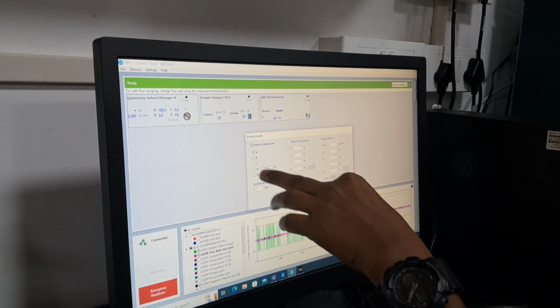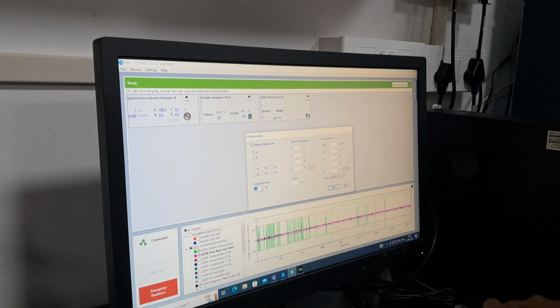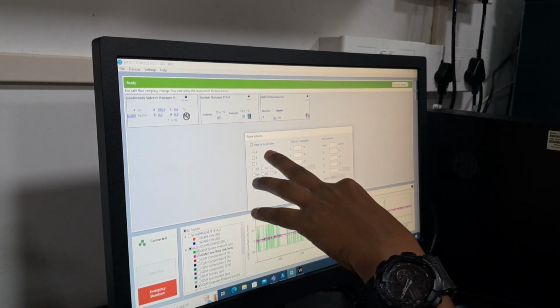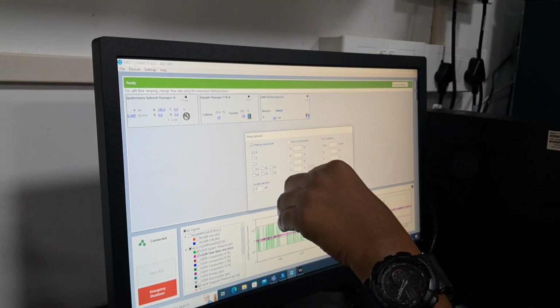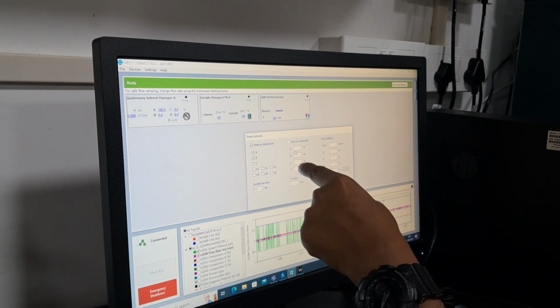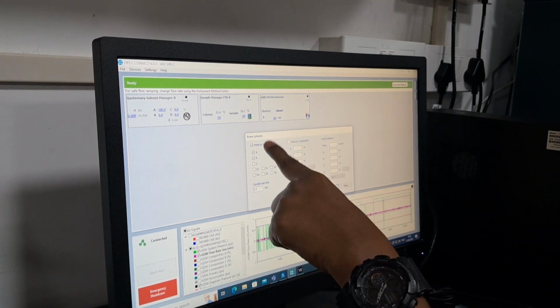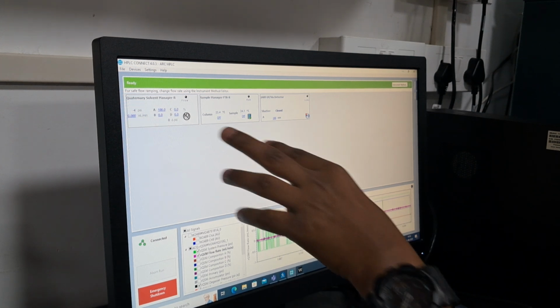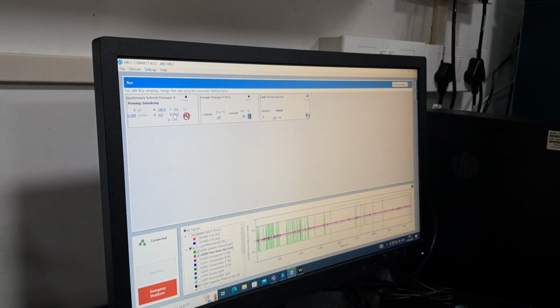I'll just now give a line for 1 or 2 minutes, and I will show you how the flow comes out of the pump. You can select A and B. It is not highlighting. Just we'll give only the A and B, the individual priming. I'll give the start. As soon as you give the start, we'll get a sound. Okay, it has happened.